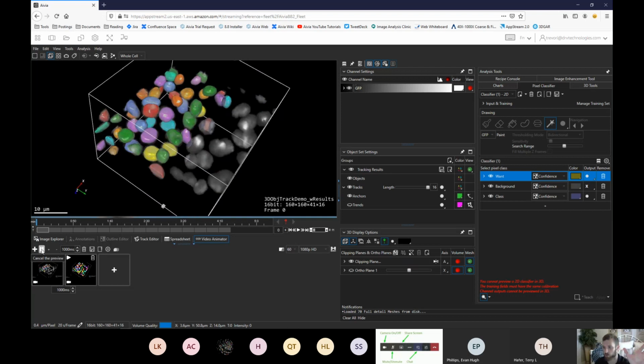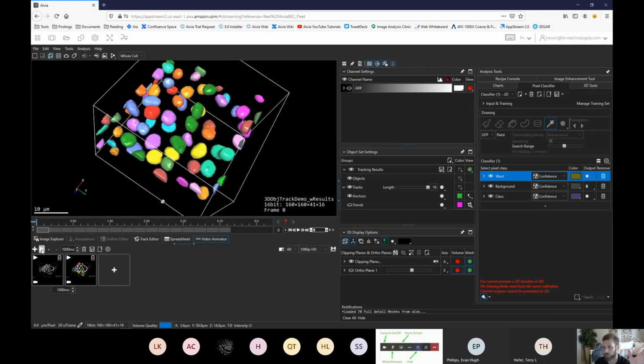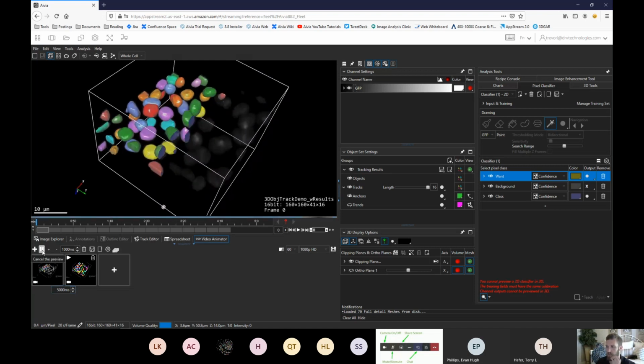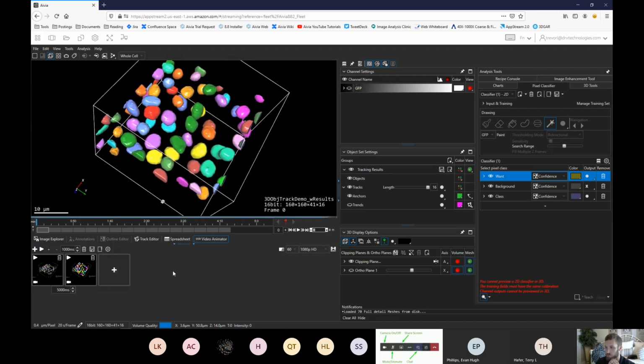So if I click play now, that's what happens. Okay, and sometimes there can be flickering things whenever it's playing as a preview that, whenever you render, it's not part of it. I can also change how long this transition takes to happen. So if I make that 5 seconds instead, you see it's a lot slower.